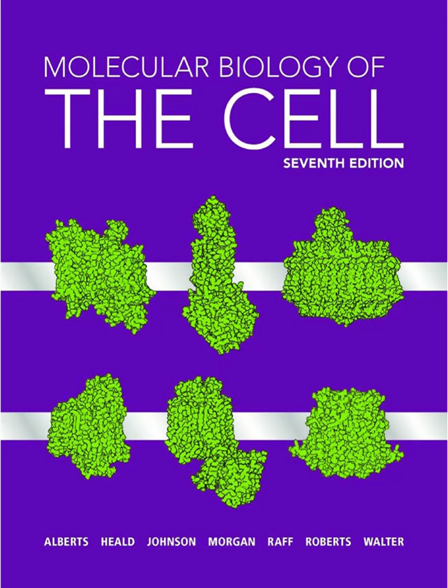Like green light. Exactly. So you shine the excitation light, blue, on your sample, and then you use a special filter to only look at the emitted light, green. And your labeled molecule just glows against a dark background. Precisely. It makes it possible to detect very small amounts of a specific molecule because the signal is so distinct from the background. What does the microscope setup involve?